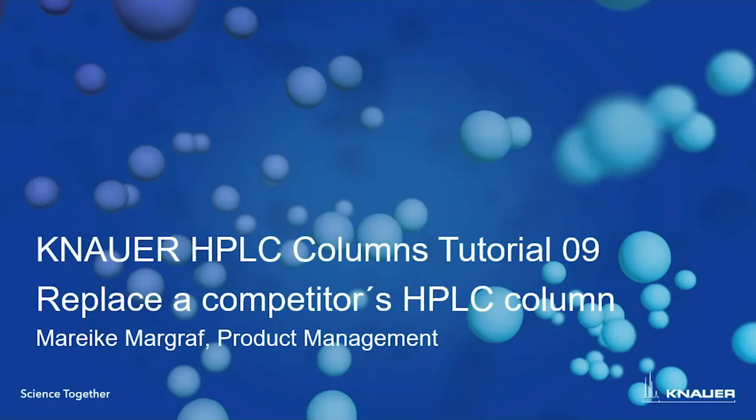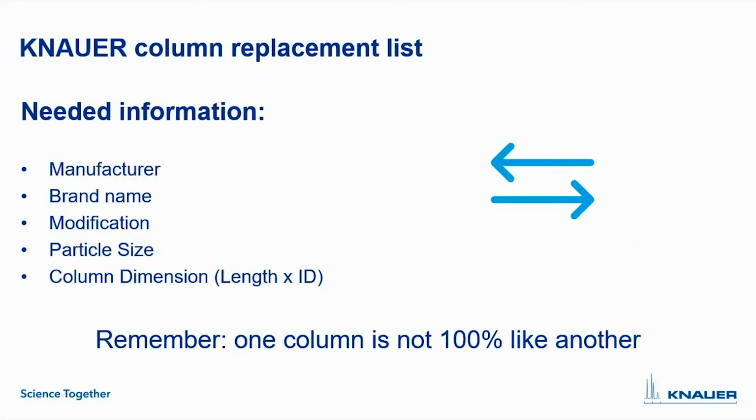In this video, we want to talk about replacing a competitor's HPLC column with a KNAUER column. Therefore, KNAUER has a tool implemented for you. It is called the KNAUER Column Replacement List, and it can be found on our website, for example.